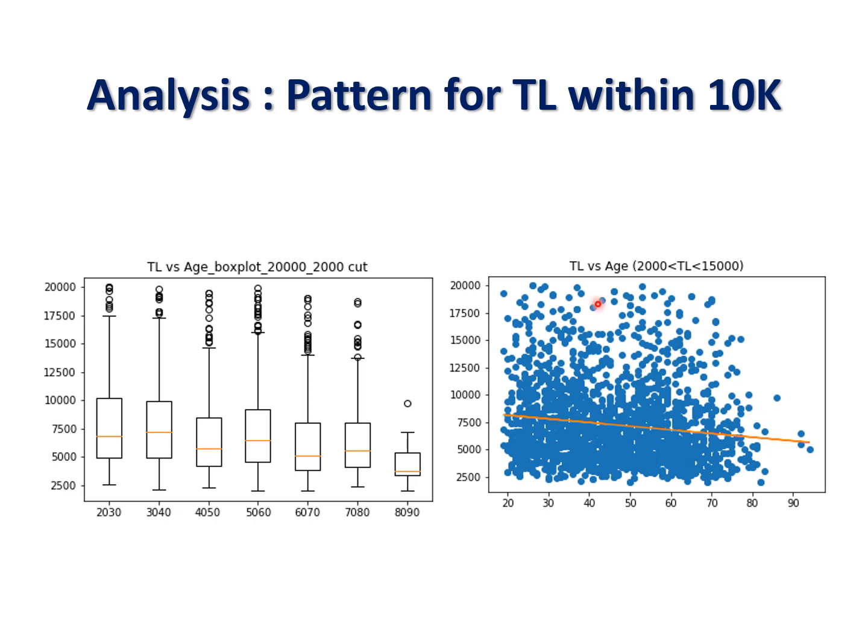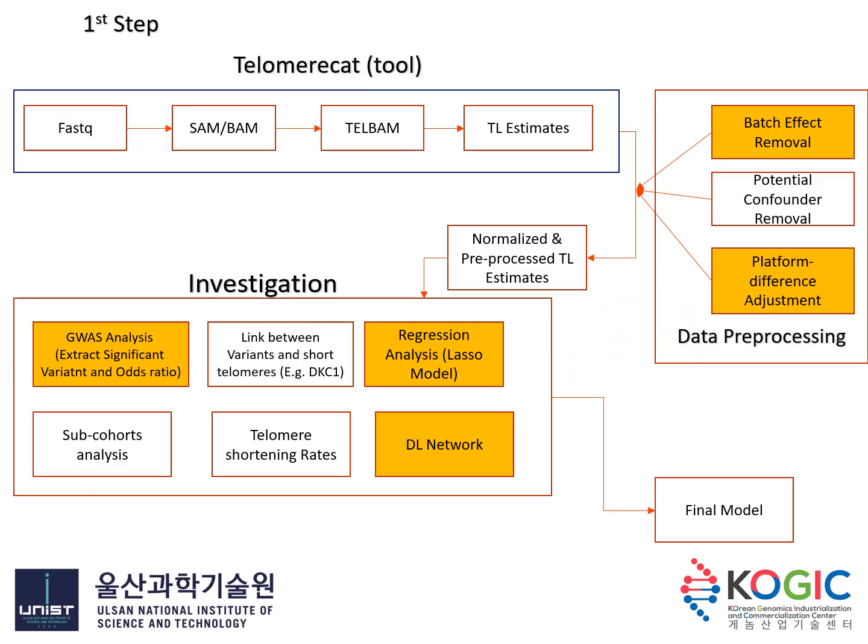And this is the telomere length measured computationally. We can see there is a slight relationship between age and telomere length, but we're measuring the length again using different tools as well. And these are the specific steps for the first part, where we have to use different tools to measure the telomere length computationally. I'll describe the specific steps in the next presentation. Thank you.